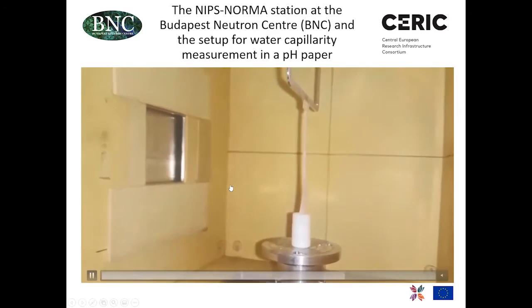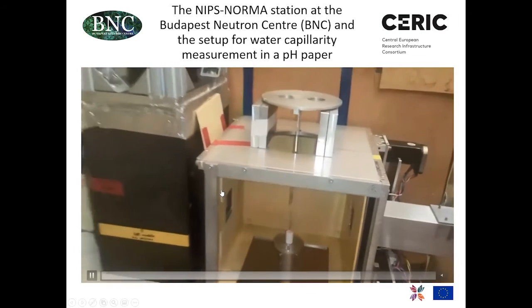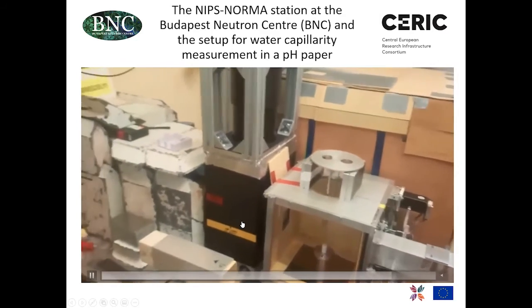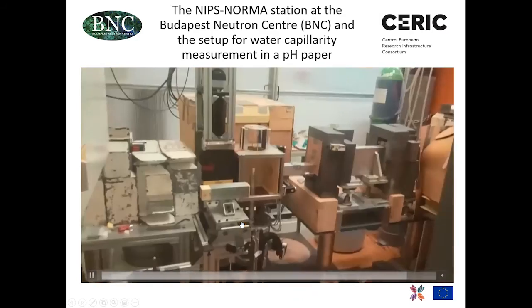And now we can start taking images. Of course, we need to go away first and start the neutron beam.